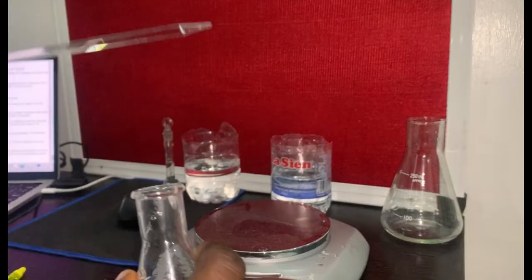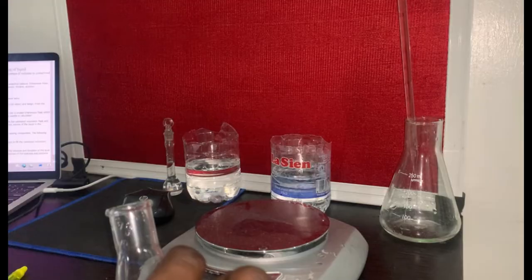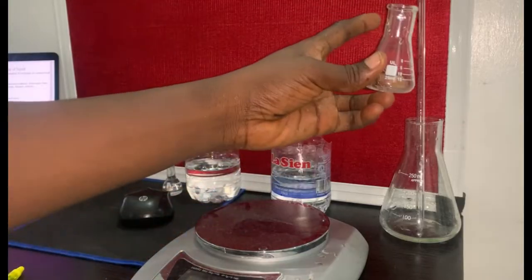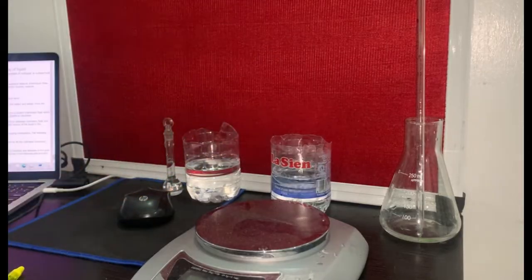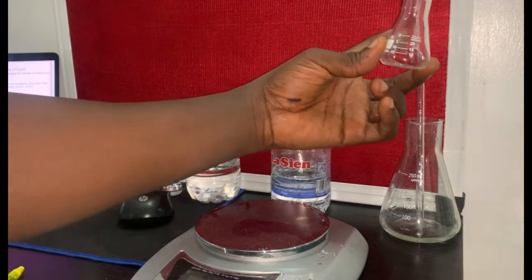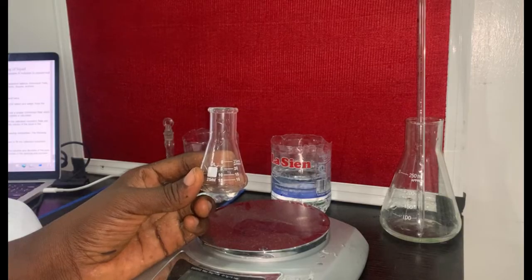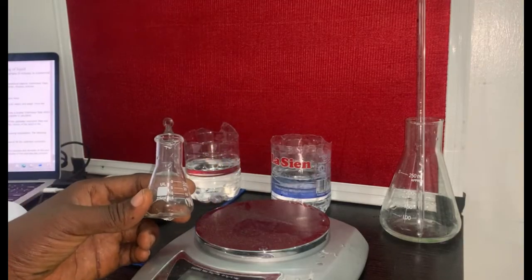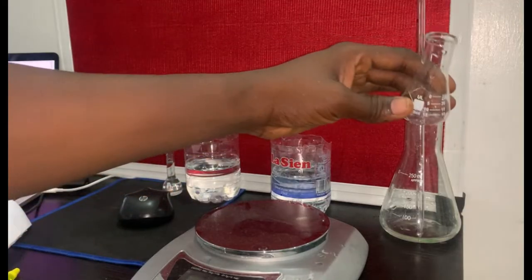Now, I used to advise students that you don't necessarily have to carry out this 5 times. Honestly, you don't have to. Once you transfer, you put one of this pipette inside this flask. This flask alone, the empty, is 21.52. You now take 5 ml with this pipette and drop it inside here. You weigh it again. We now got 26.52, which is the mass of this flask plus the mass of water delivered by the pipette.